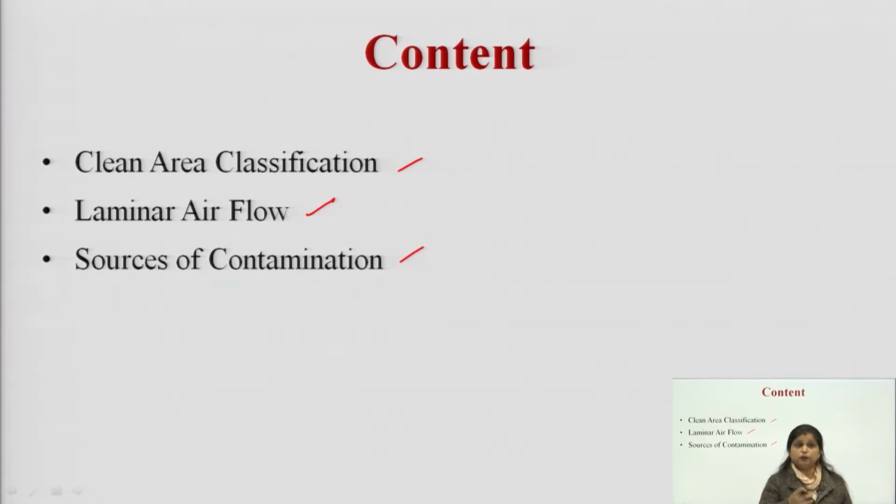There should be no microorganisms within those products. That is why we always take extra precautions when dealing with parenteral products and ophthalmic products.